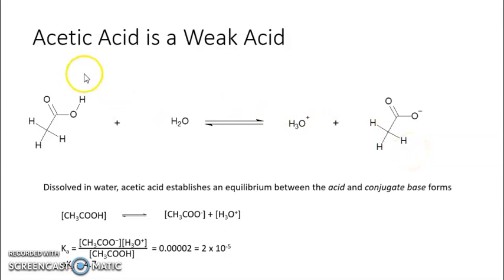So in today's experiment, we're going to use acetic acid. And acetic acid is a weak acid. It has a pKa value. A strong acid is fully ionized and does not have a pKa.